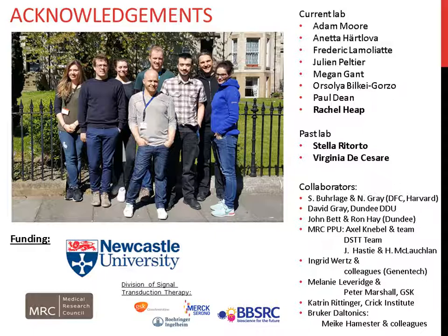The next question is, is it possible to determine enzymatic kinetic parameters, such as inhibition constants or Michaelis-Menten constants, by MALDI-TOF procedures? Yes, we have done all of these. We have done KMs, kcat in the paper. If you want to read them up, in our recent papers we have done them using MALDI-TOF mass spectrometry. In some cases, when you go to really, really high concentrations of substrates, it becomes a bit problematic. But we have in all cases been able to do it.